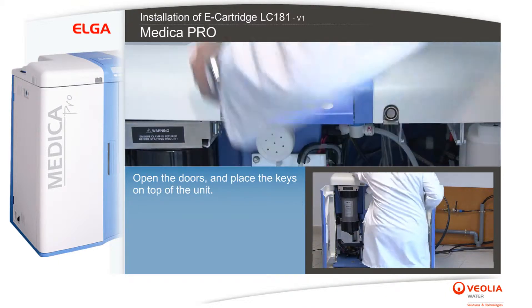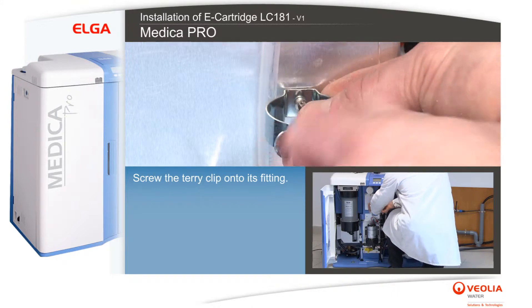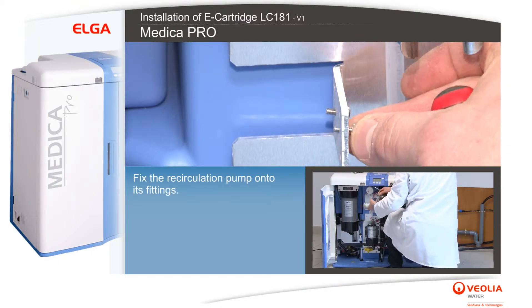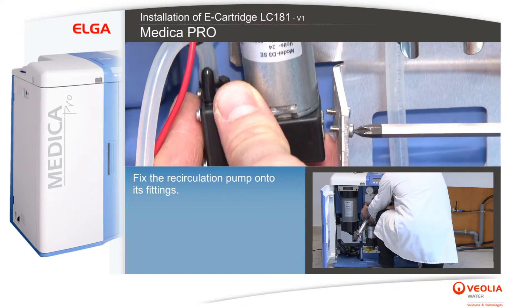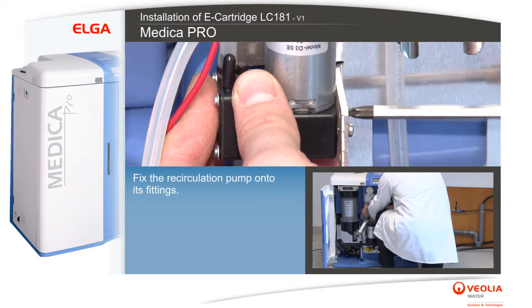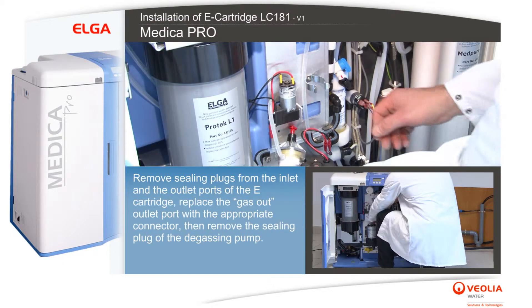Screw the terry clip onto its fitting. Fix the recirculation pump onto its fittings. Remove the sealing plugs from the inlet.